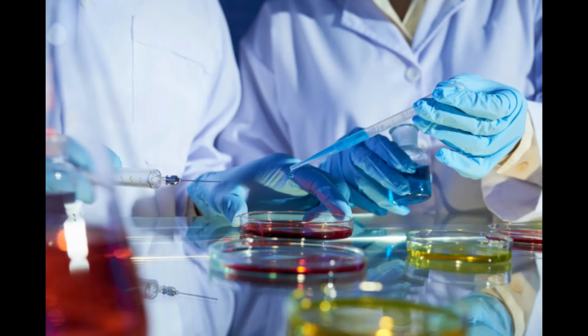Flame the end of your test tube. So just a one-two real quick over the end of the test tube. Run it across the flame. Then you're going to take your inoculating loop that's got your Serratia on it, and you're going to dip it down into your broth. You're going to try not to touch the sides of the test tube. Right? Hard to do. And then give it a little switch, trying not to touch the sides of the test tube. And you pull it back out, flame the mouth of the test tube again, put the lid back on. All without setting anything down.